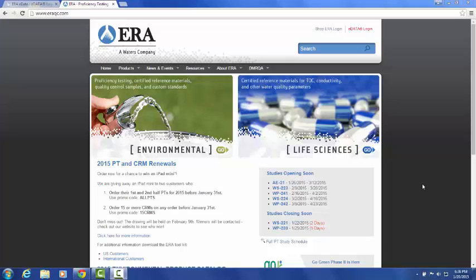Please note that the site that we're previewing today is still in the testing phase and is being presented from an internal QA server used for programming and testing purposes. As a result, navigating and opening pages within the site today will be slower than it will be after the software has been completed and migrated over to ERA's main production servers.